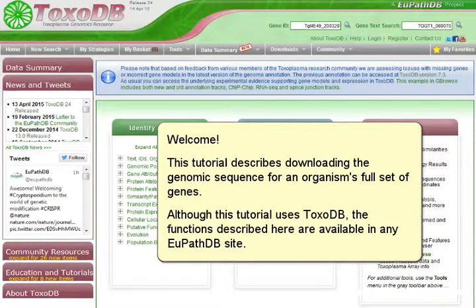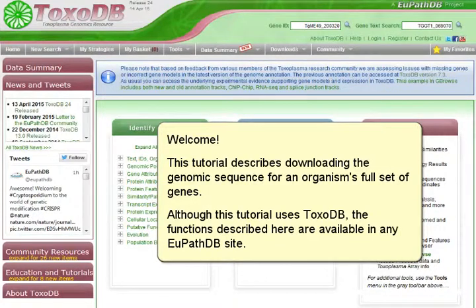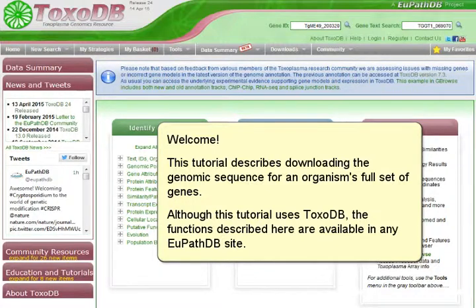Welcome. This tutorial describes downloading the genomic sequence for an organism's full set of genes. Although this tutorial uses ToxoDB, the functions described here are available on any VEuPathDB site.